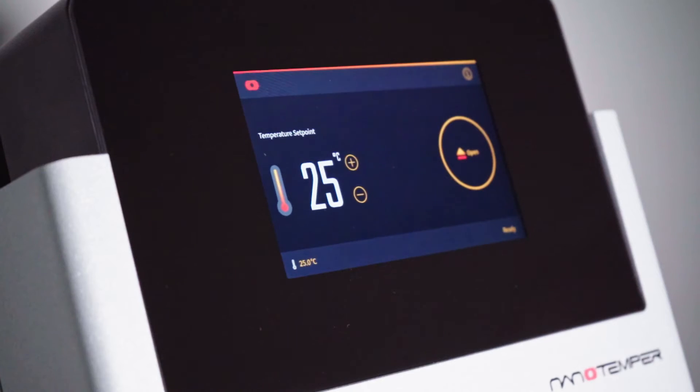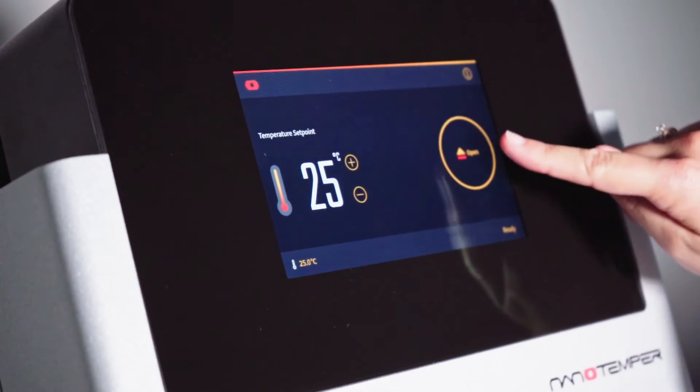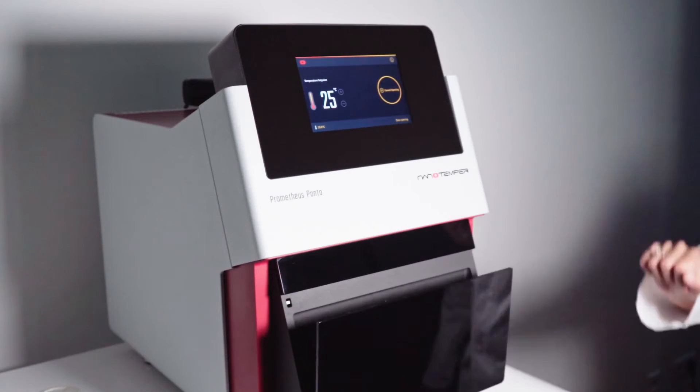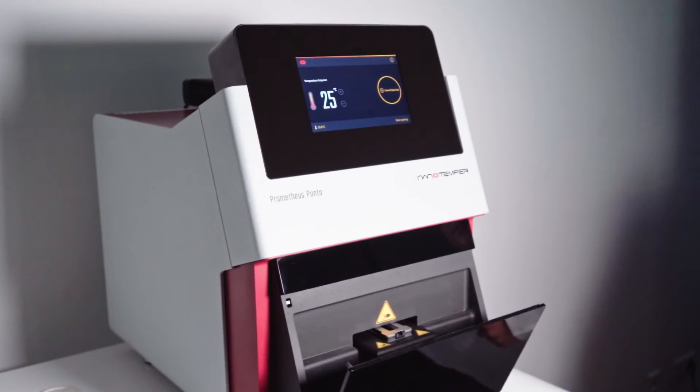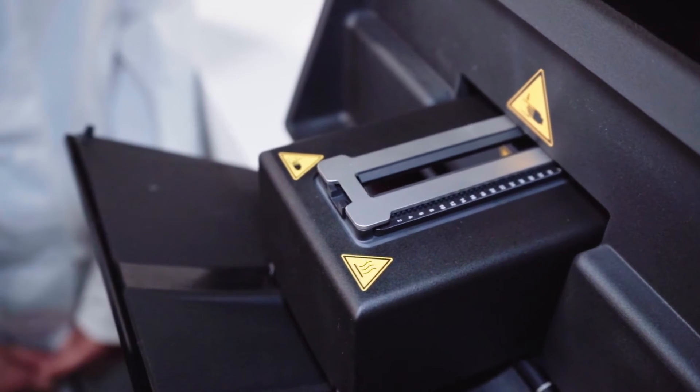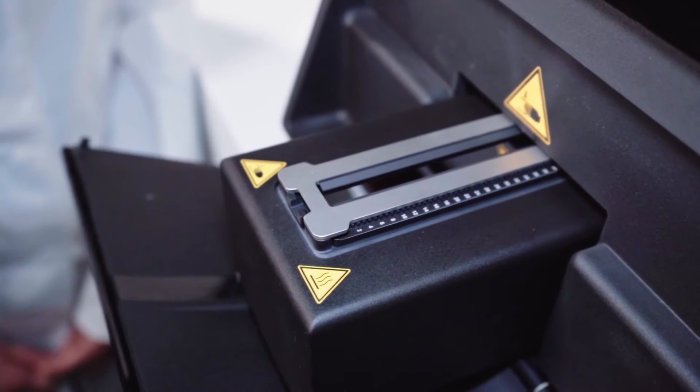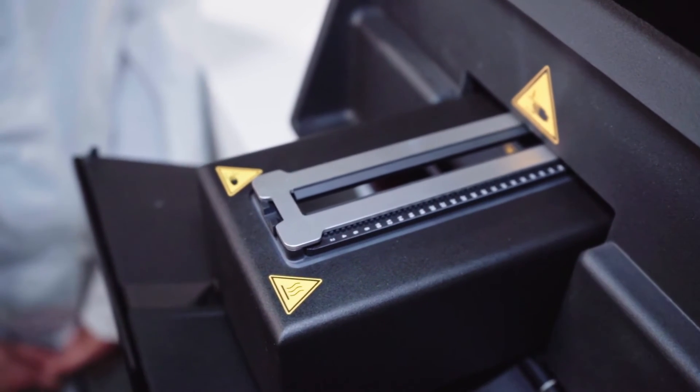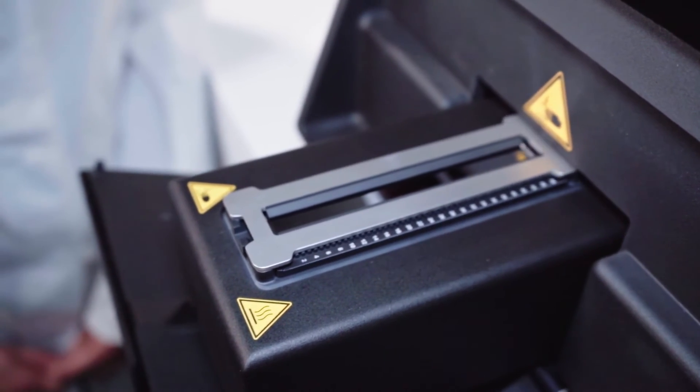Starting an experiment on Prometheus Panta is really straightforward. There is also very little sample preparation needed. Have your samples ready in Eppendorf tubes or if you're working with well plates, 384 and 96 well plates work as well. You can simply open the door using the touch screen on the instrument front panel. It will automatically open the door for you to access the capillary tray. You can also use the Panta control software to open and close the door for you.